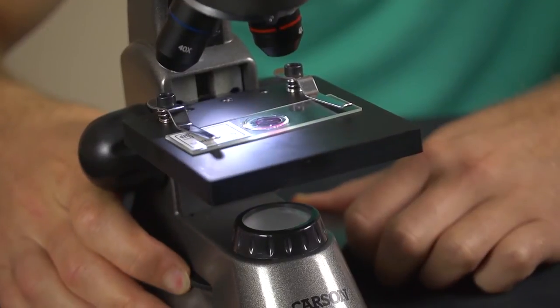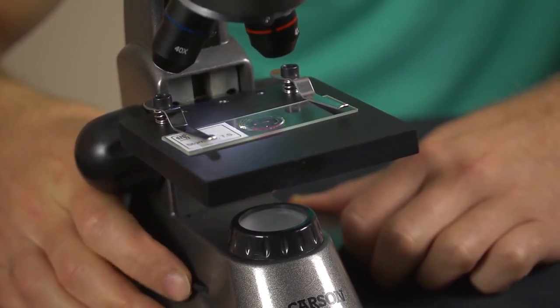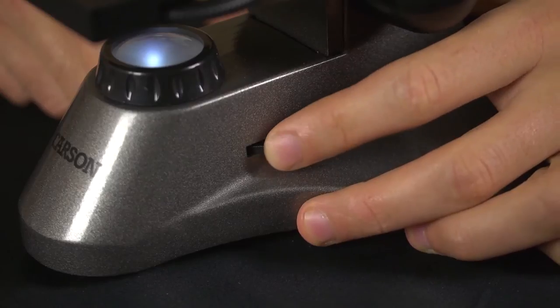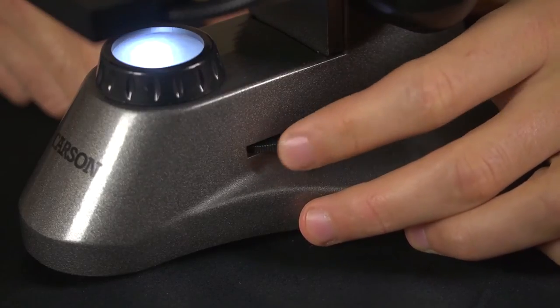One light comes from above the stage and acts as a reflective light source. The other comes from directly underneath the stage and is a transmitted light source. This is what helps you see through transparent organisms.